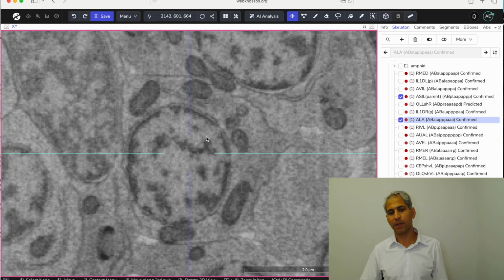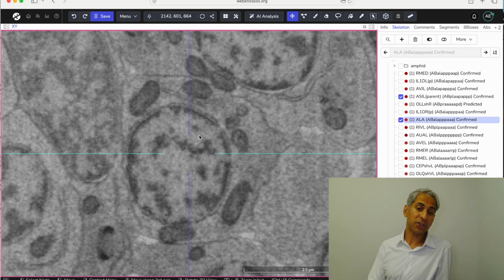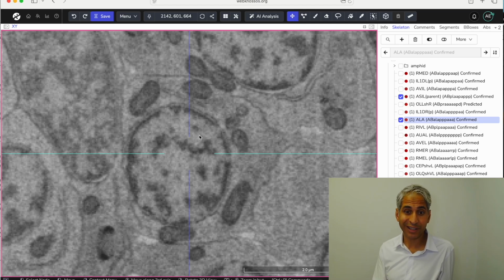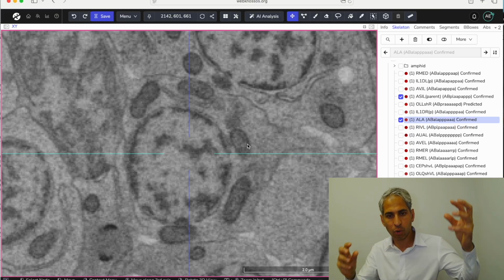Okay. Based on what did I say these are mitochondria? Well, first of all, this is the nucleus. Okay, the next question is, what are the largest organelles or parts of a eukaryotic animal cell? Well, in this case, it's going to be mitochondria. Next up on things you should be able to see in this data set, in terms of membrane-bound, enclosed, maybe bean-like, tube-like, noodle-like shaped organelles.